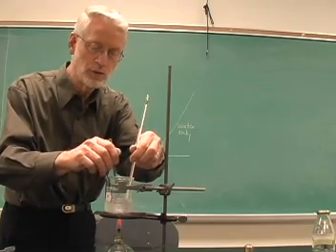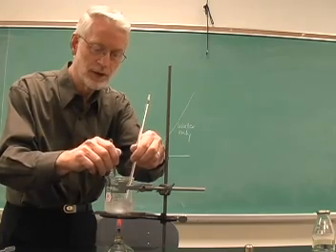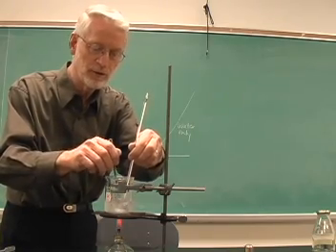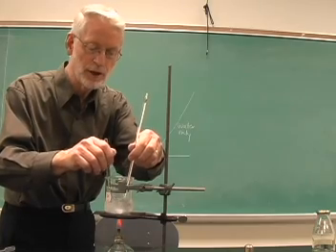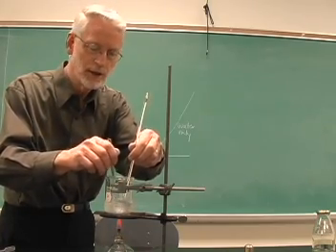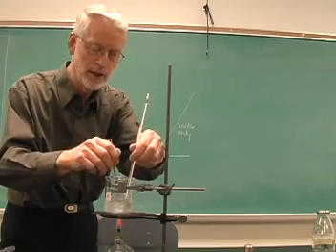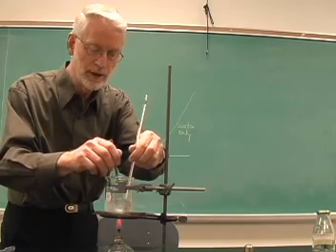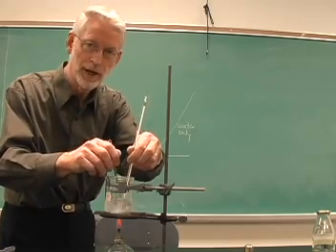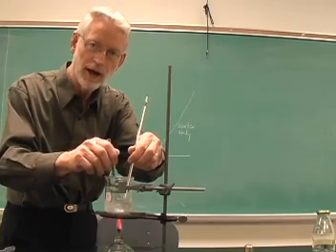So it's important for students to continue stirring so that the temperature remains uniform throughout, and it's also important to use crushed ice so that there are no large chunks of ice in the beaker, which will take a long time to melt. So here they have an opportunity to do an exercise involving both measurements and then graphing the results.